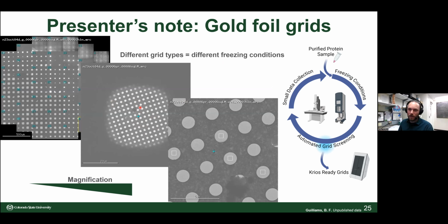At the time it was, okay, that confirms maybe some hypotheses, but ultimately, I didn't have a single image with a protein in it through like 6 grids or something like that. So ultimately, the grid type you use, you want to stick with that, or you have to optimize the freezing conditions with the different grid types.